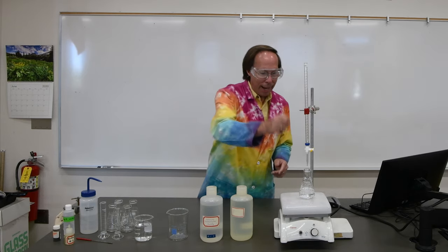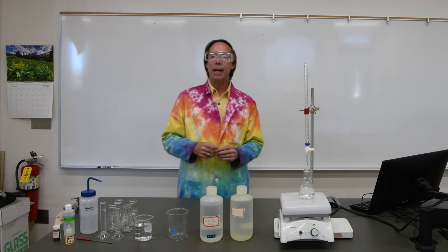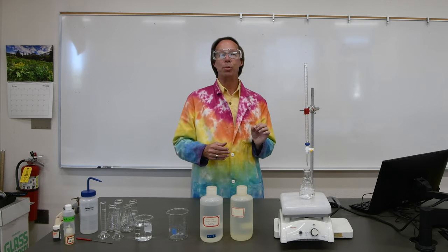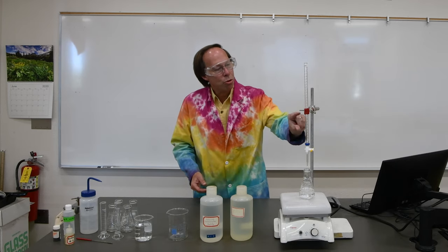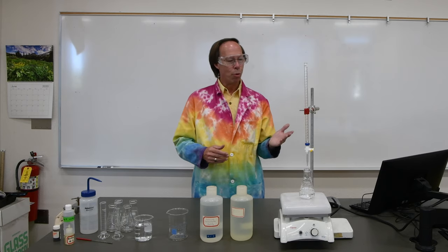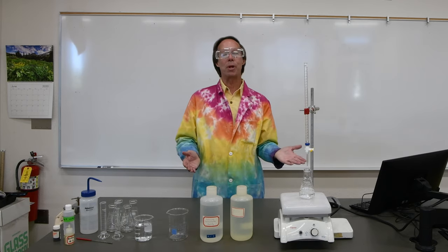We will simply add our reactant from the burette, reactant A, until the color just changes from red to blue, and at that point we will know that the reaction is complete, and then we can use the volume that was required to determine the moles of the unknown in our solution, and thus we can figure out the concentration.